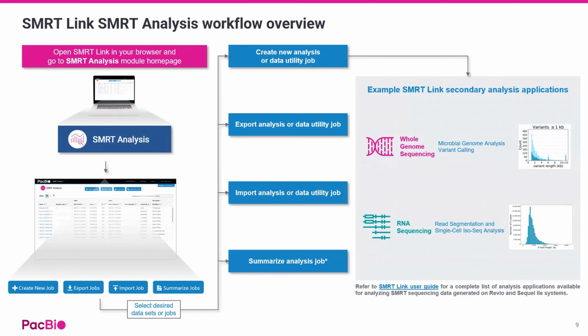This module lists a table of completed analysis jobs rather than the raw dataset table that we see in data management. New jobs can be created with the Create New Job option, followed by selecting the desired datasets, and finally selecting the desired analysis workflow or data utility.